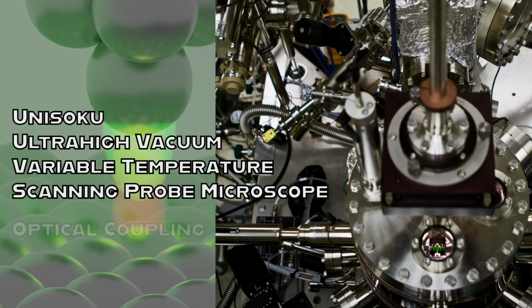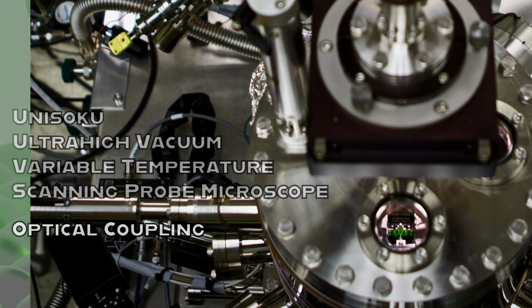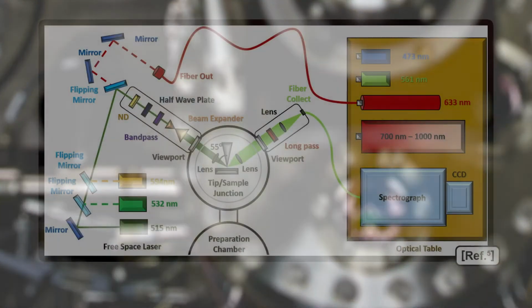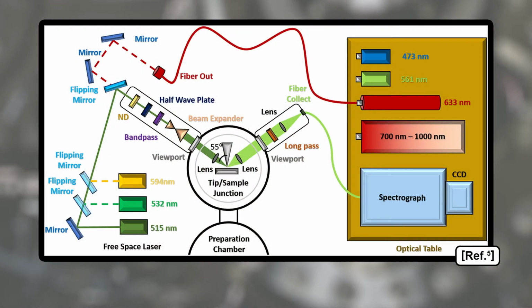on a surface. My research relies upon an ultra-high vacuum, or UHV, custom-built variable temperature scanning probe microscope coupled with optics. This schematic illustrates the optics that allow us to efficiently couple lasers of multiple wavelengths to the tip-sample junction via a combination of optical fibers and flipping mirrors.